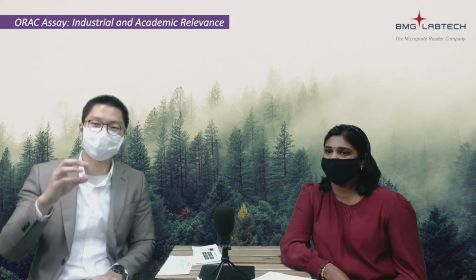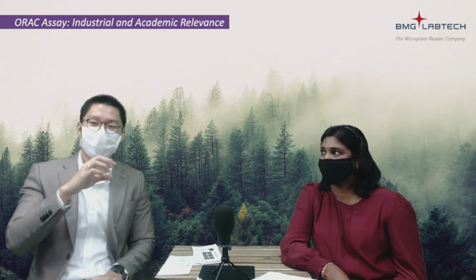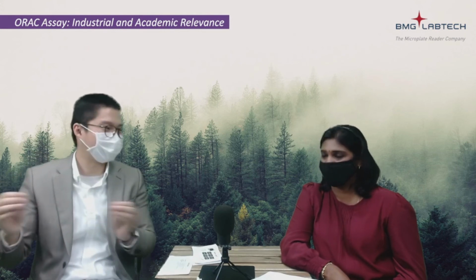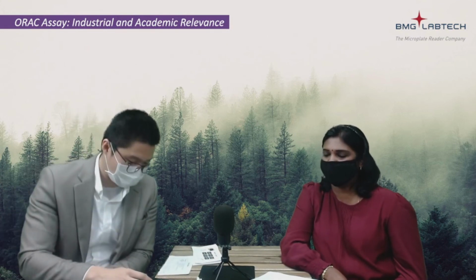For example, impure samples, contaminants or clumps can affect your reading. Whereas with fluorescence, the signal directly correlates with the strength of the antioxidants itself. So even though there might be some impurities here and there, it doesn't affect the interaction that much compared to absorbance.